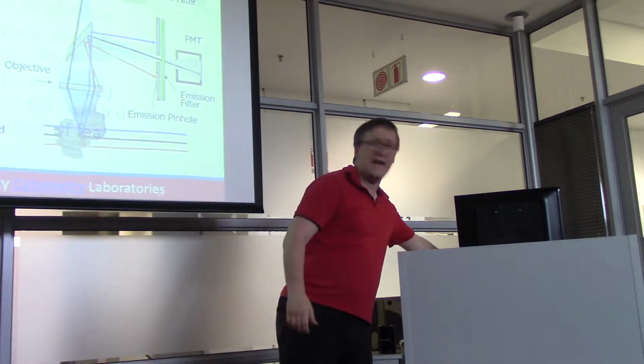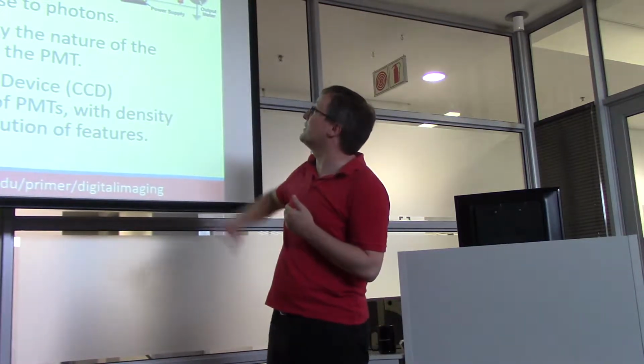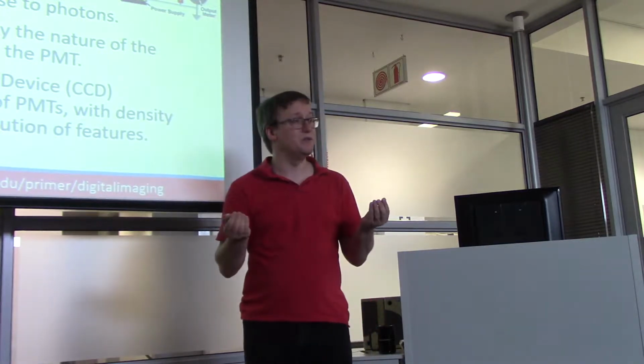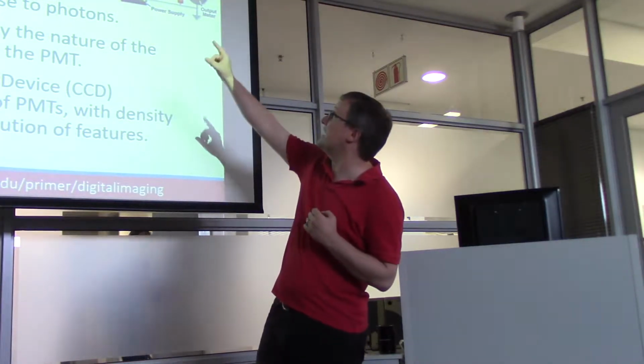So that is a very brisk overview, but talking about PMTs is also worthwhile. A photomultiplier is something that we can make very, very small. I know that this looks like a can with a whole bunch of mirrors in it and so on. But in fact, PMTs can be made very, very small. And as we mentioned yesterday, sometimes the cameras we use in our phone have millions of these things packed into the surface in a charge-coupled device. So these PMTs, the photomultipliers, are very, very tiny to make and are exquisitely sensitive.